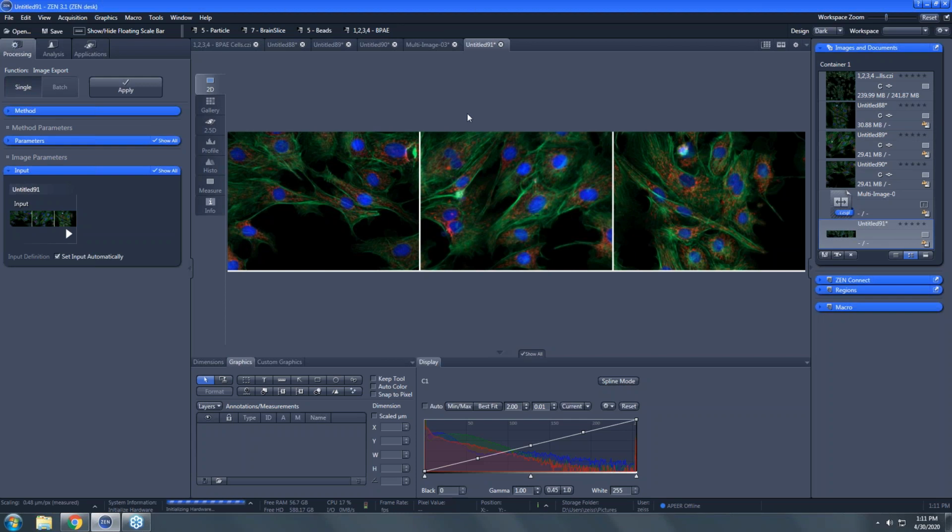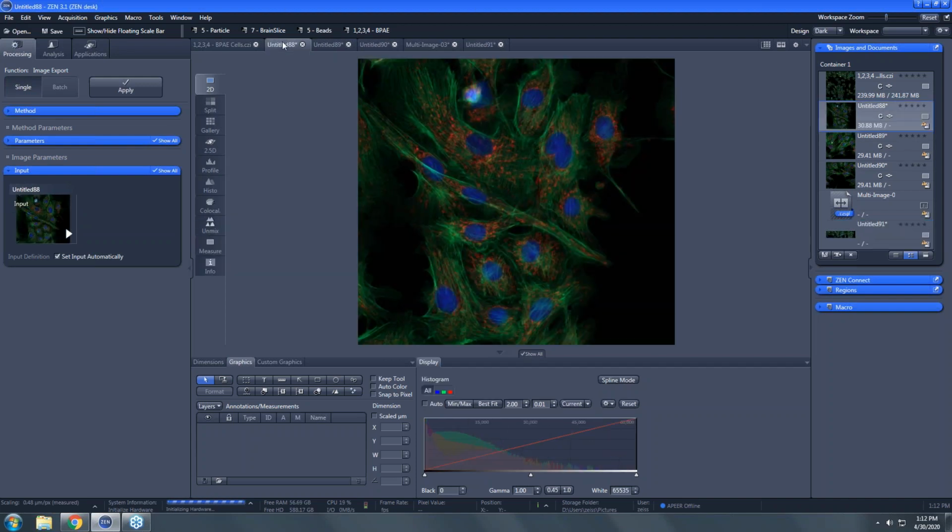All right. We've got our multi-panel figure, but probably we want to add some annotations to it at some point or another. So why don't we go back to one of these images that you've cropped out previously, Nicole, and we'll add some annotations and discuss just formatting and then doing some measurements. How's that? Sounds good. Perfect.